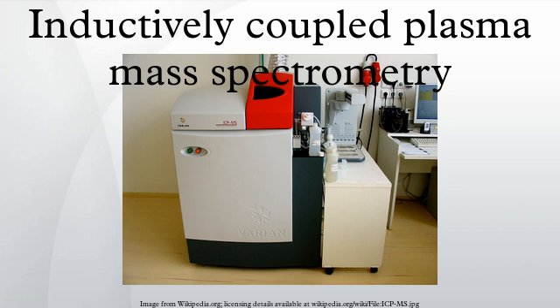In these plasmas the positive ions are almost all singly charged and there are few negative ions, so there are nearly equal amounts of ions and electrons in each unit volume of plasma. An inductively coupled plasma for spectrometry is sustained in a torch that consists of 3 concentric tubes, usually made of quartz. The end of this torch is placed inside an induction coil supplied with a radio frequency electric current.